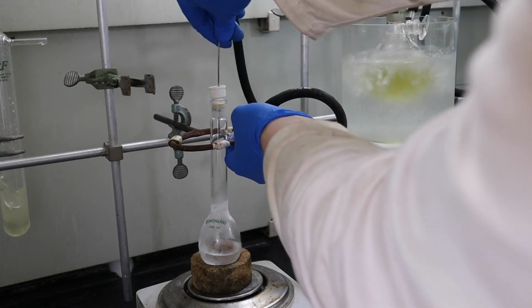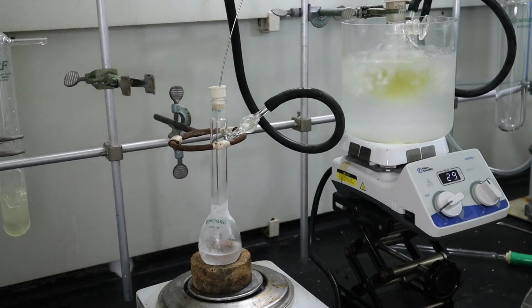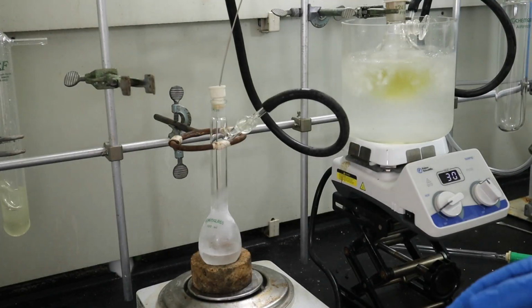I was planning to use another cannula transfer with the methylamine flask on a scale to measure how much I actually transferred. Shortly after I started the transfer, the odor of methylamine reached my nose. I was so focused on getting the transfer done without injuring myself that I knocked the camera away and lost the rest of the shot. My plan to measure the amount added with the scale also failed. However, the methylamine was to be added in excess, and I know that I added an excess based on volume.